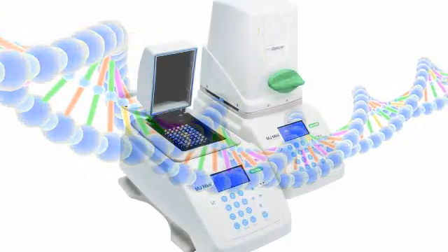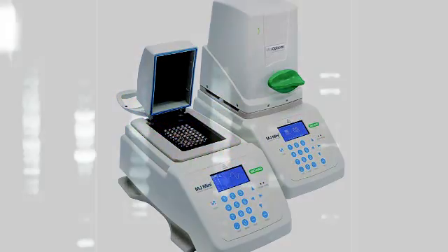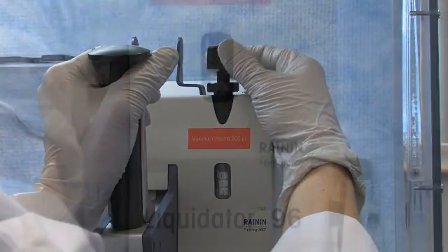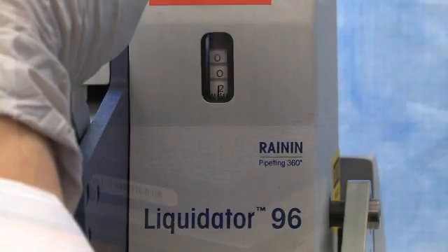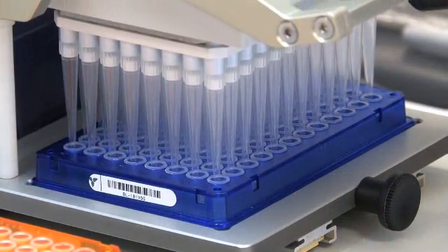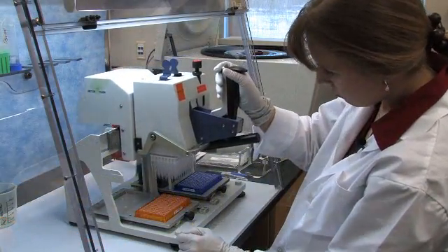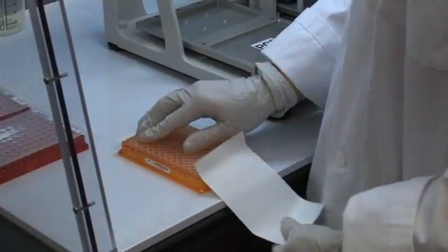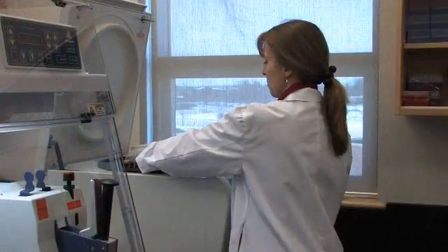Following DNA extraction, the next step is DNA amplification using PCR. To set up the PCR plate, two microliters of extracted DNA sample is added to a premade PCR plate containing master mix. The plate is then sealed and spun in the centrifuge.